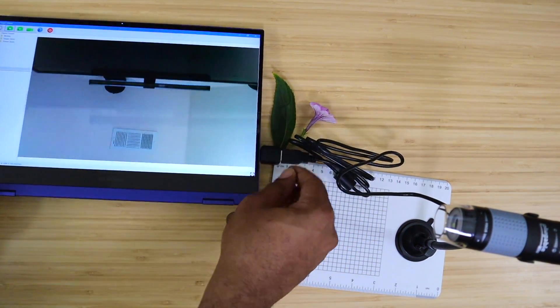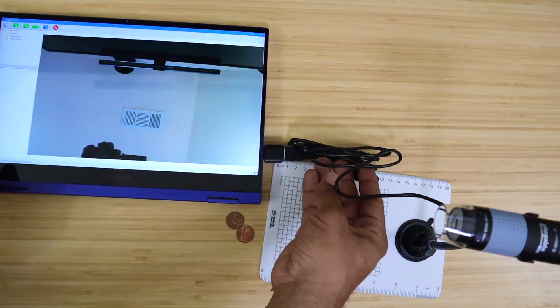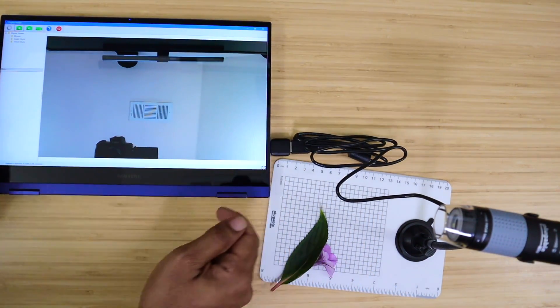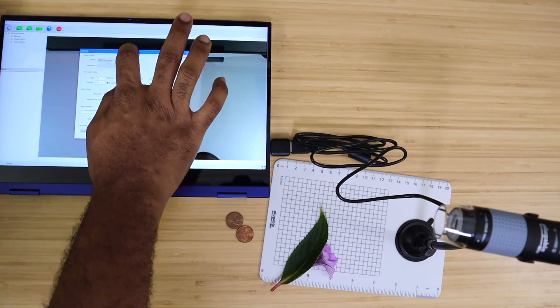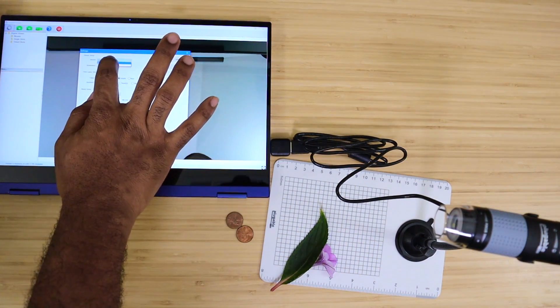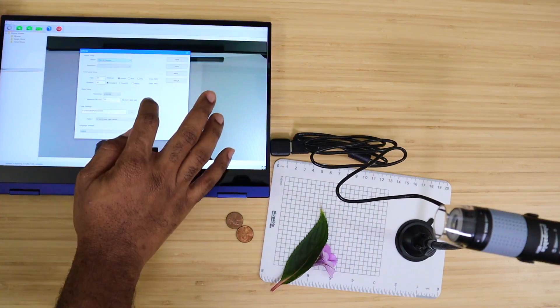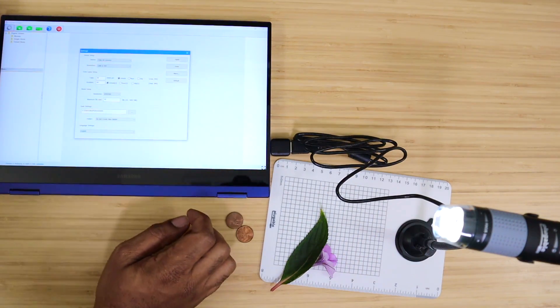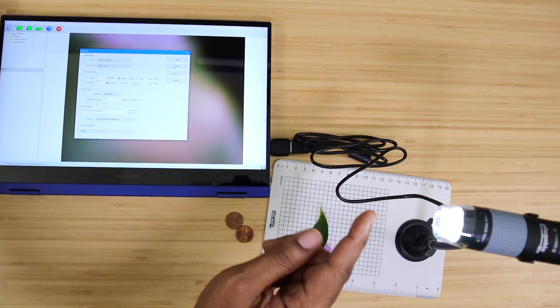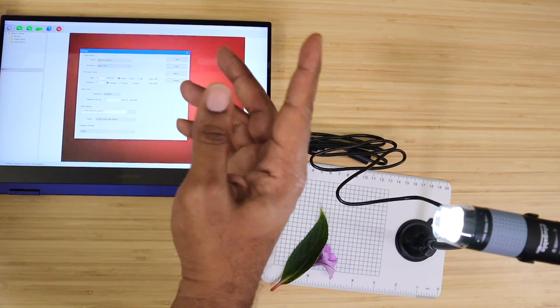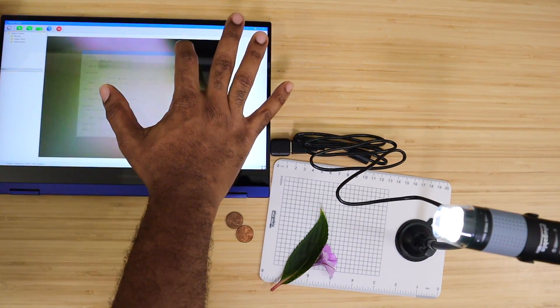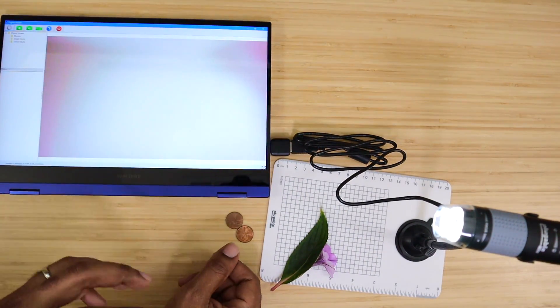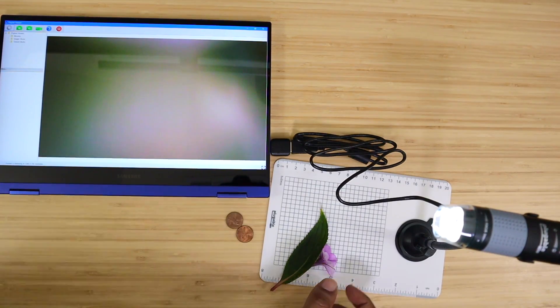There we go. So right now it's actually working on the camera that's built into the computer. If you go into your settings and choose the digital microscope camera, it now lights up over here. See, you can see on the screen. I'm going to apply that and then take you on a quick tour of what you can do with this device.